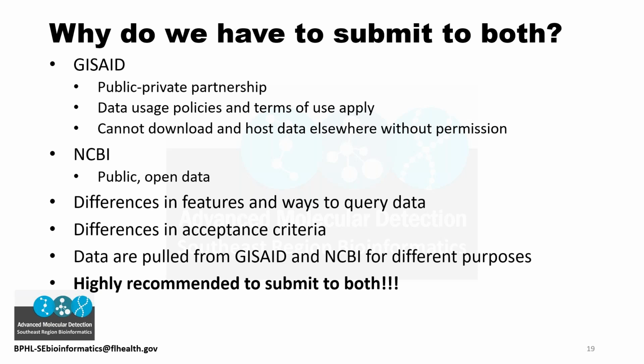They have differences in what they will accept and what they won't. We try to make it consistent across both databases, so that what you submit to GenBank and what you submit to GISAID is the same FASTA sequence, and vice versa. If you ever run into a situation where one database accepts a sample and the other one doesn't, and you need to go back and make a correction, make sure to go back to the other database, email them, and send them the updated file, updated metadata, or whatever it is that you had to change.